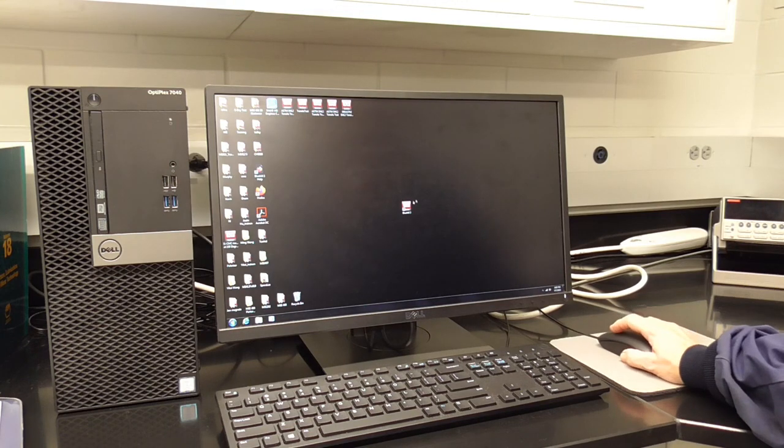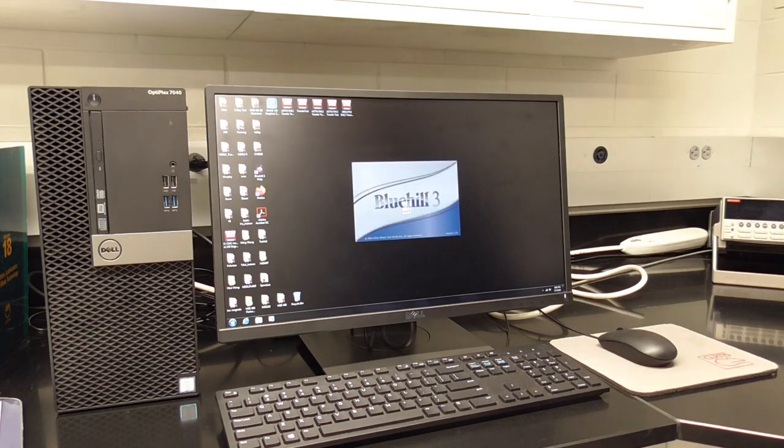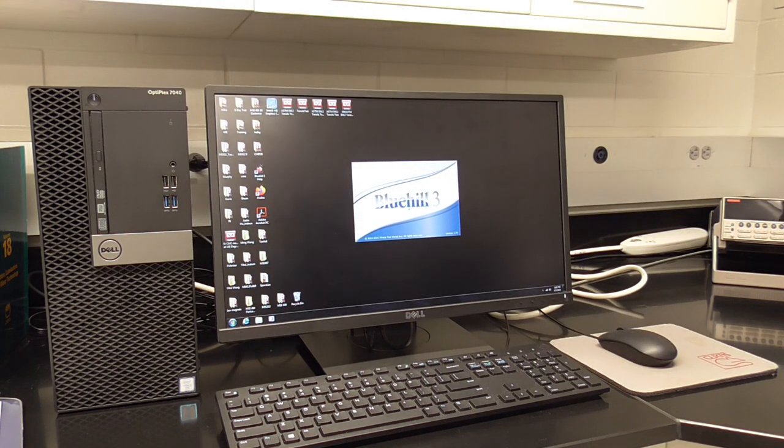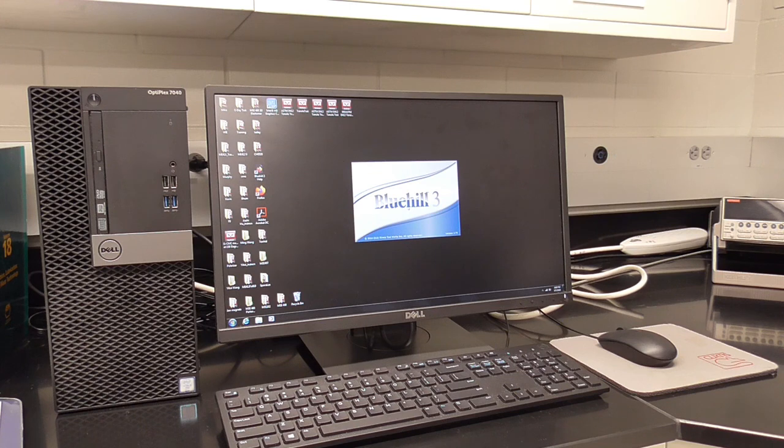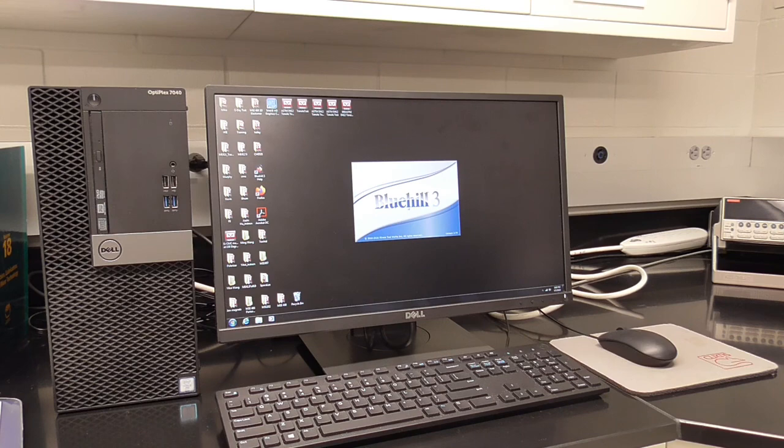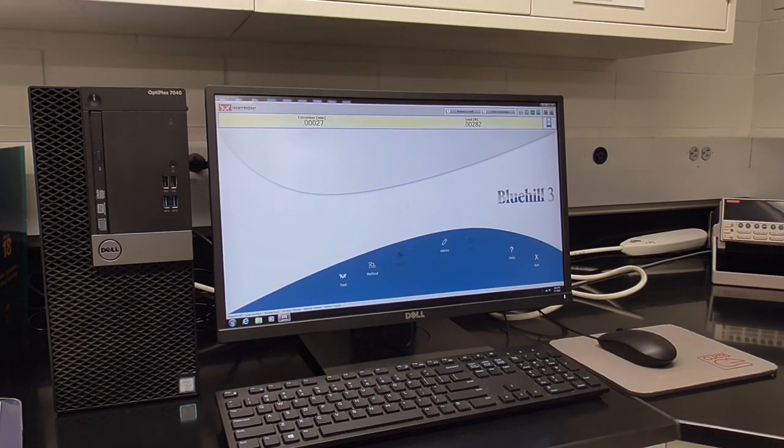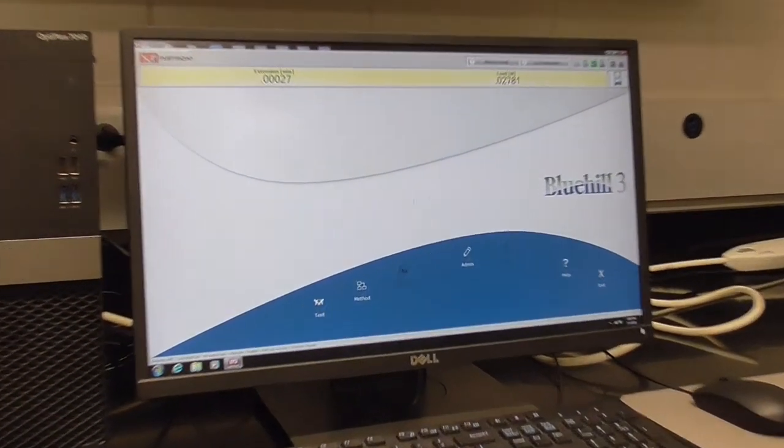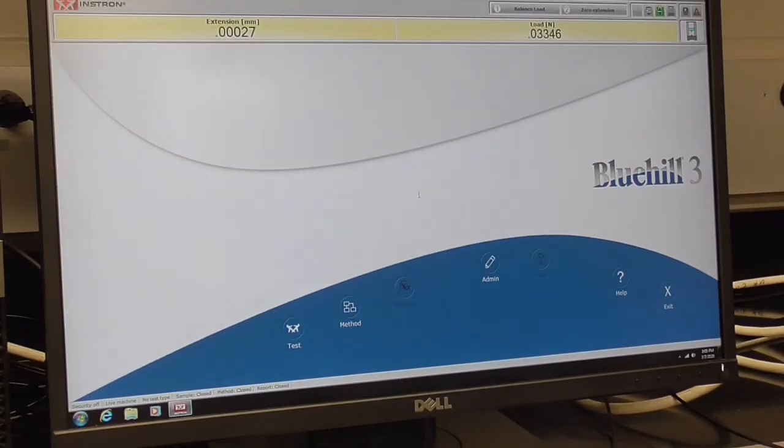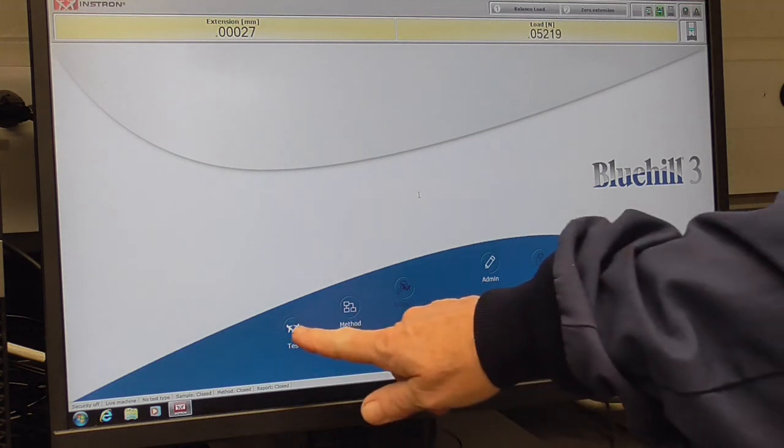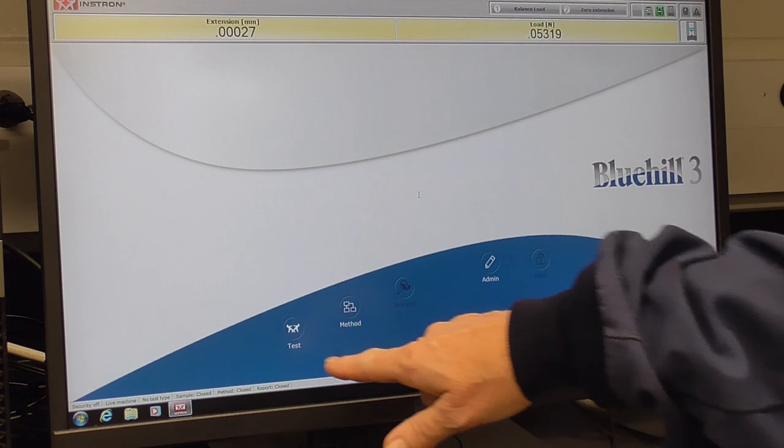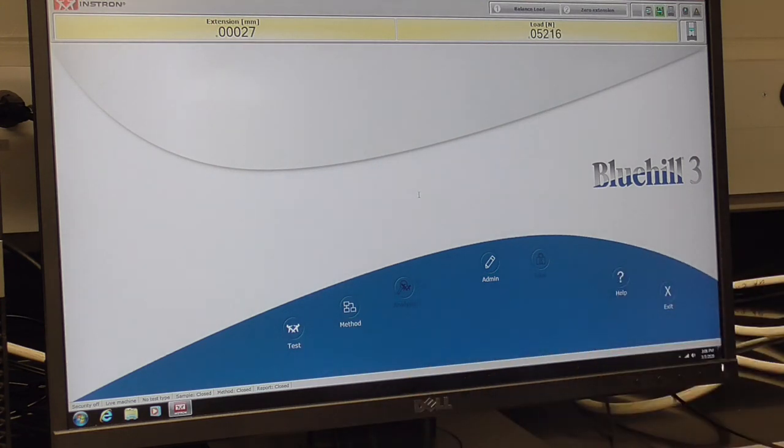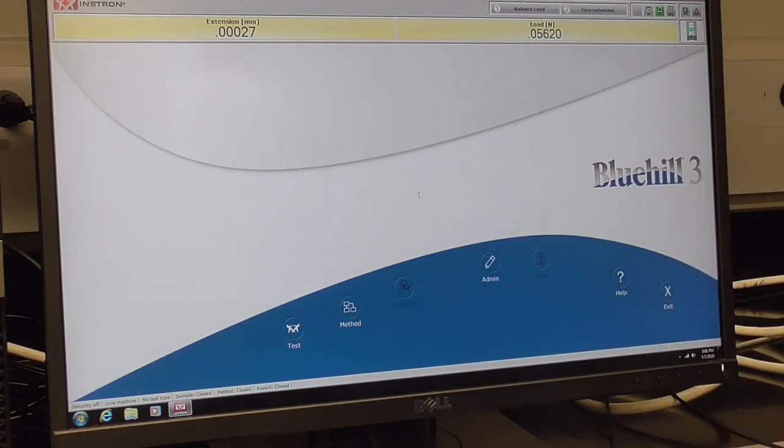The software is here, Blue Hill 3, and we can open that up. This is our home screen for running a test. Down here you can choose this icon to run a test or this one to create or edit a method.